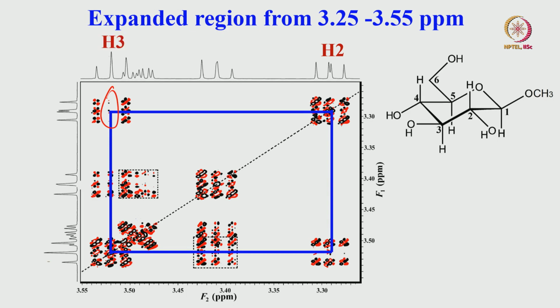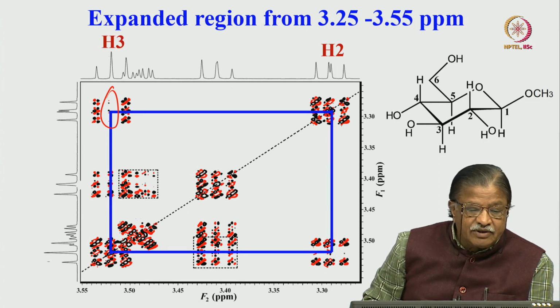Okay, this is the antiphase character. As a consequence, instead of 1:2:1, a 1:0:-1 intensity pattern comes. So that can happen sometimes. The central peak can disappear like that. Okay, doesn't matter. From this you start, complete the square. So that has to be proton H3.